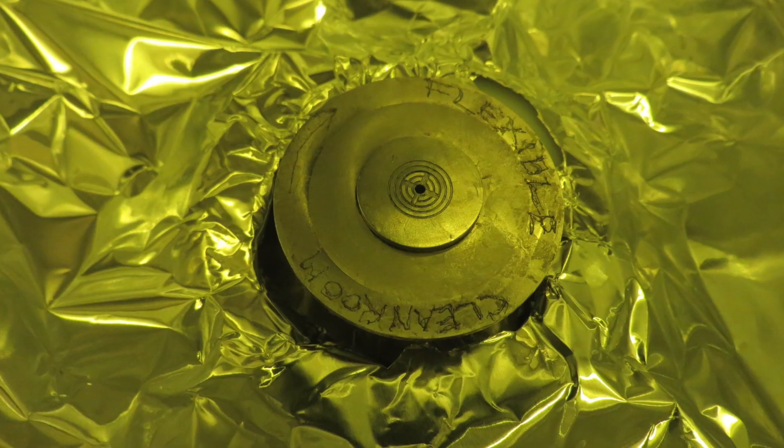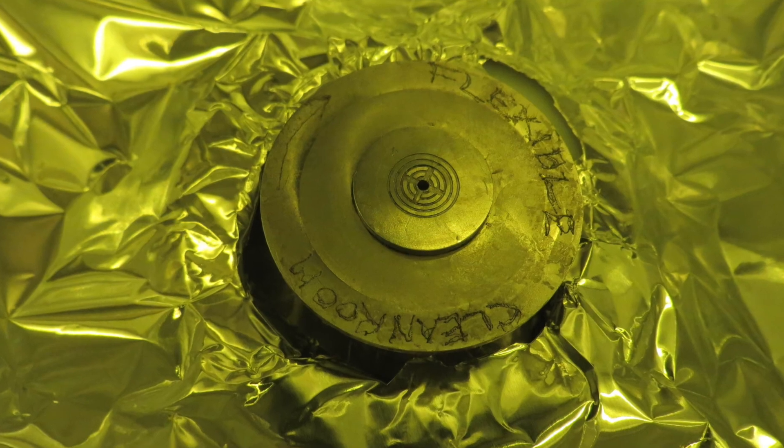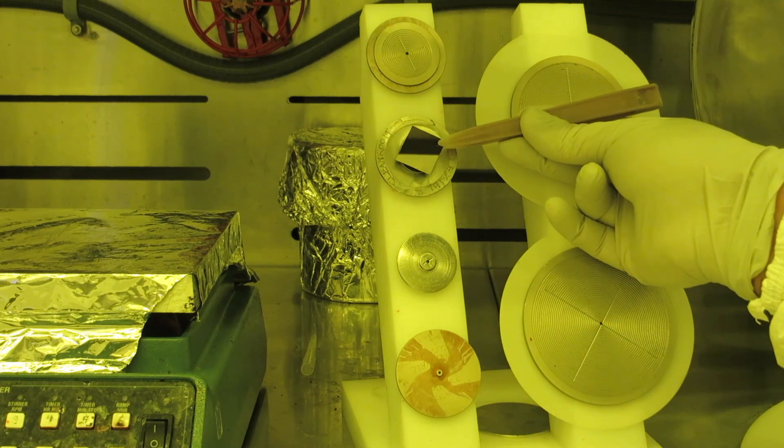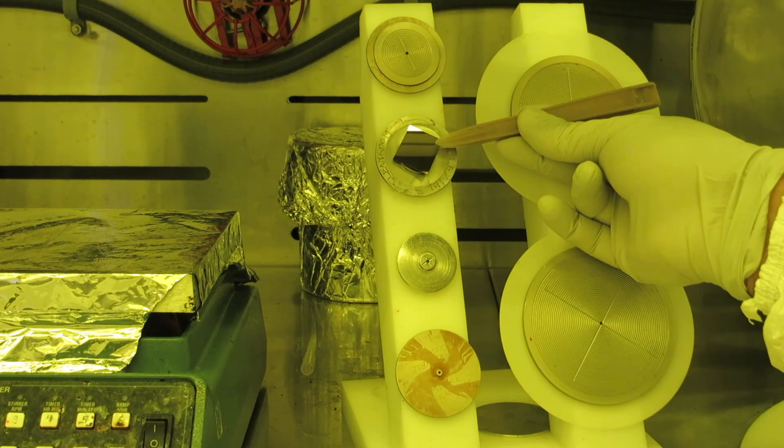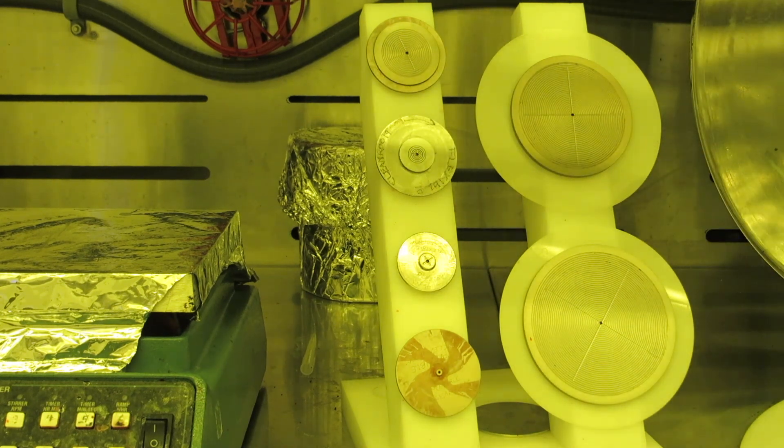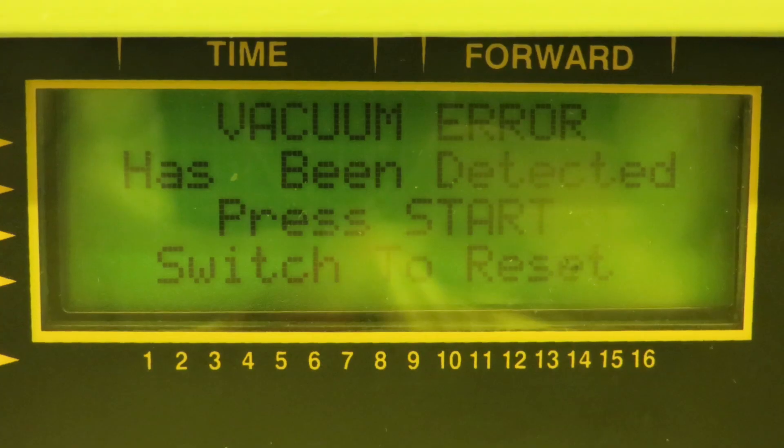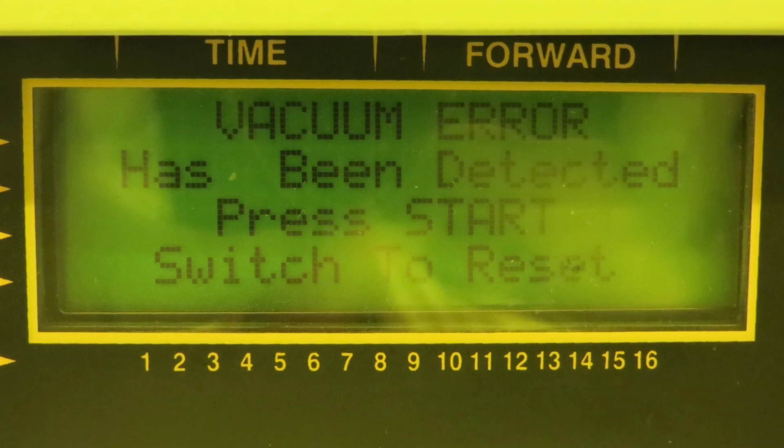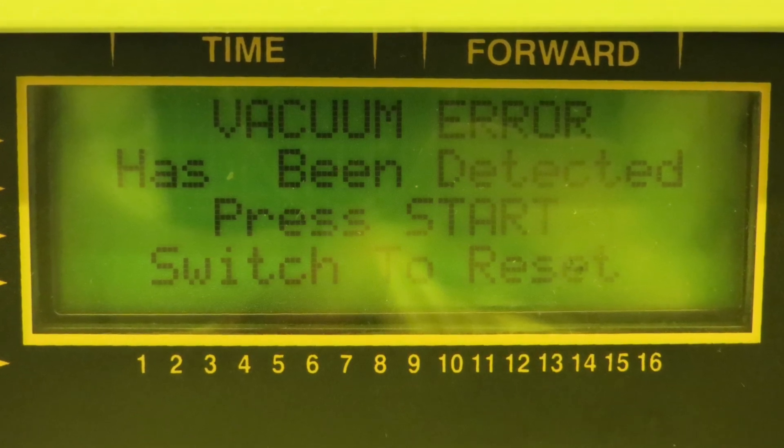An easy way to verify if the vacuum circuit is working properly is to place your gloved finger lightly over the top of the spinner shaft to plug up that hole. Then hit the green button to start spinning. If it does not spin after a few seconds, press a little harder with your finger to create a better seal.